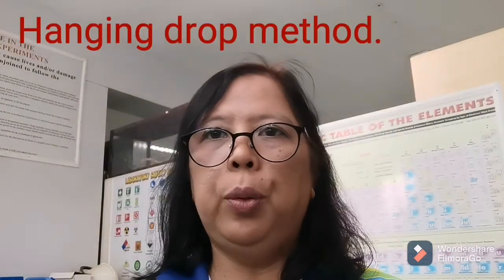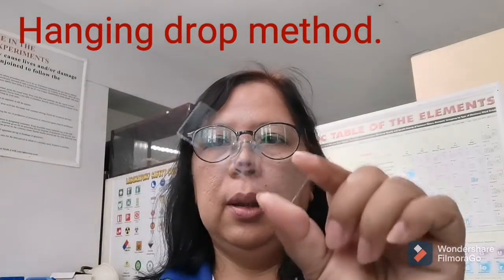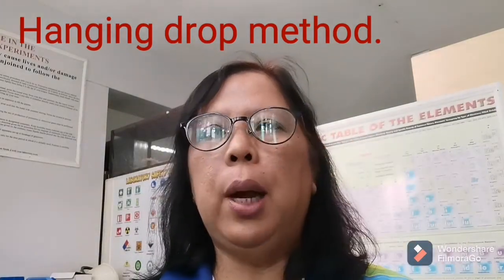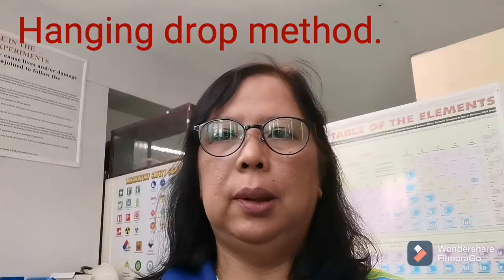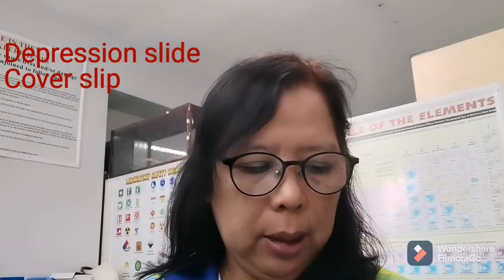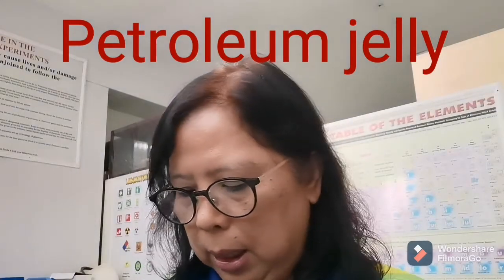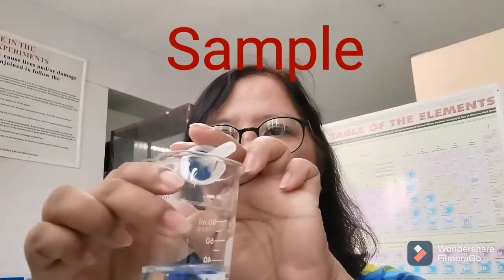I am here to perform for you the hanging drop method, to prepare this glass slide for the hanging drop method. So I will be needing the slide or the depression slide, and then of course the cover slip, and the petroleum jelly, and also the sample.